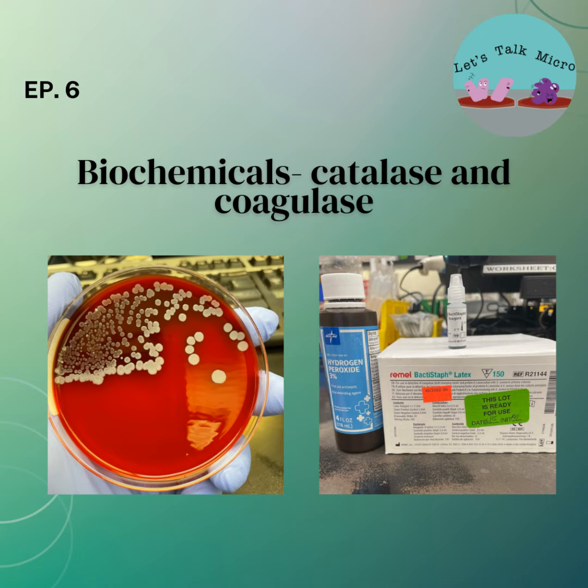That's not to say that other coagulase negative staph can't be pathogenic. Yes, they can, but normally Staph epidermidis and Staph haemolyticus tend to be non-pathogenic, more like normal skin flora.